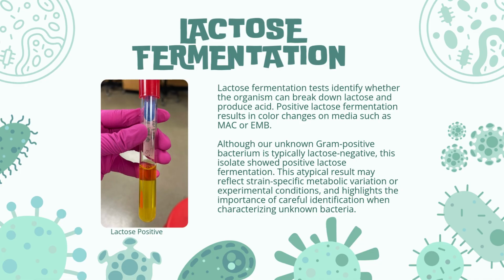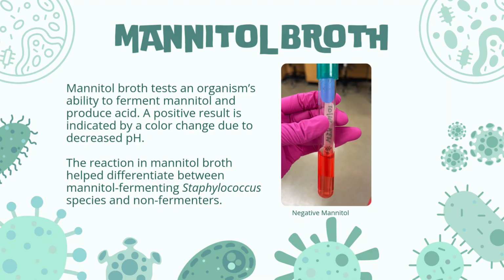The lactose fermentation test delivered an unexpected positive result. Typically, a positive lactose test points towards coliforms. However, there are documented cases where certain Staphylococcus epidermidis strains show limited or weak carbohydrate fermentation. The mannitol broth test came back negative. This was a highly significant result because Staphylococcus aureus ferments mannitol strongly, while Staphylococcus epidermidis typically does not ferment mannitol.